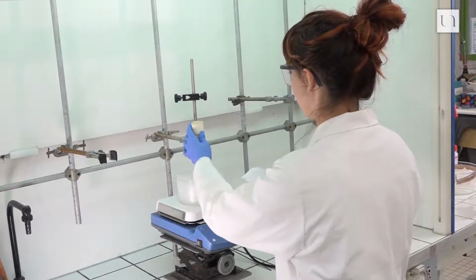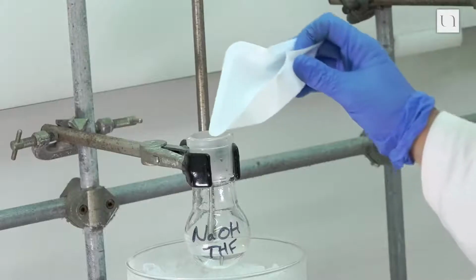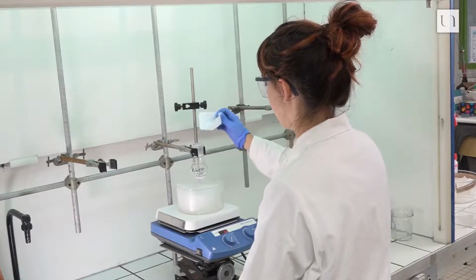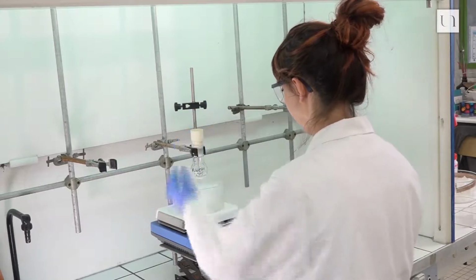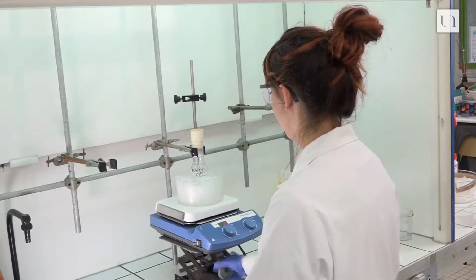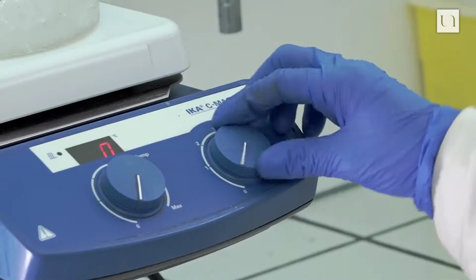To synthesize the N-alpha Boc propargyl lysine, first dissolve 500 mg of Boc lysine in a mixture of 5 ml of aqueous 1 molar NaOH and 5 ml of THF in a flask and fit the flask with a silicone septum. Cool the flask in an ice bath and wait for the powder to be dissolved.